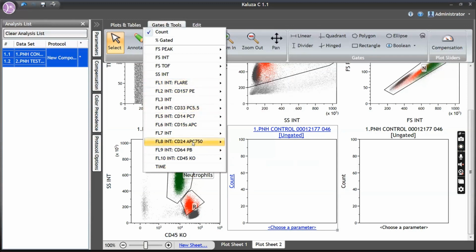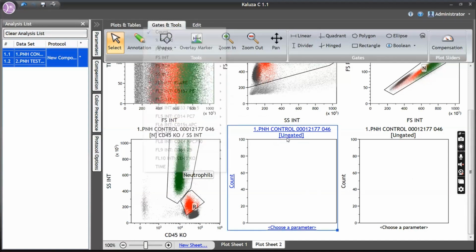You see, I am using 3 PNH markers for the detection of the PNH clone. For monocytes, I'm using CD14, FLAER and CD157. Similarly, 3 markers for neutrophils: FLAER, 157 and 24. Though advisable is 2, I'm using 3. If you use 2 it is enough; 3 is too much, but 2 is fine.